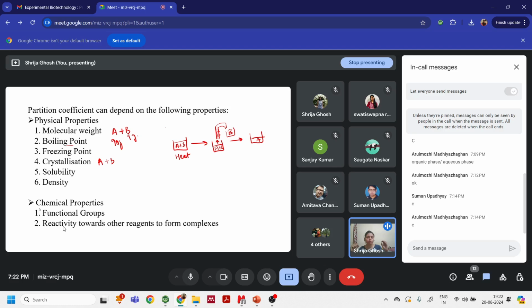If I have a mixture where that particular component is there and other things are there, when I pass it through that column, only that particular component that has a reactivity towards the functional group will react to it, and other things will get out of the column, and then I can separate my analyte.